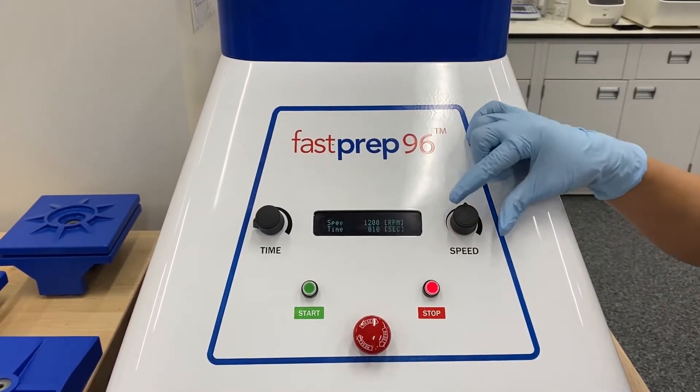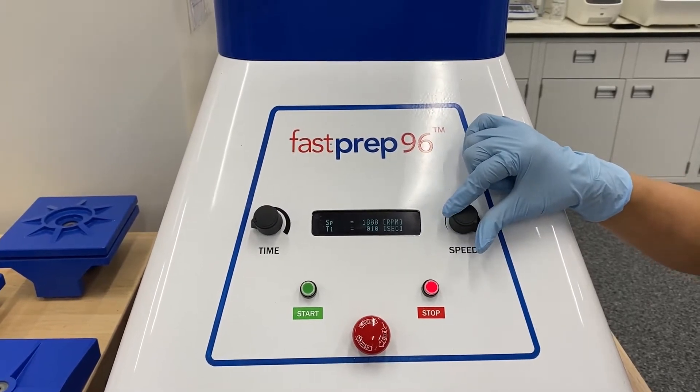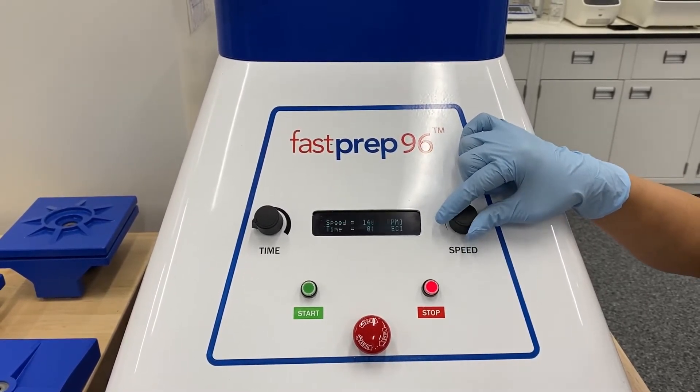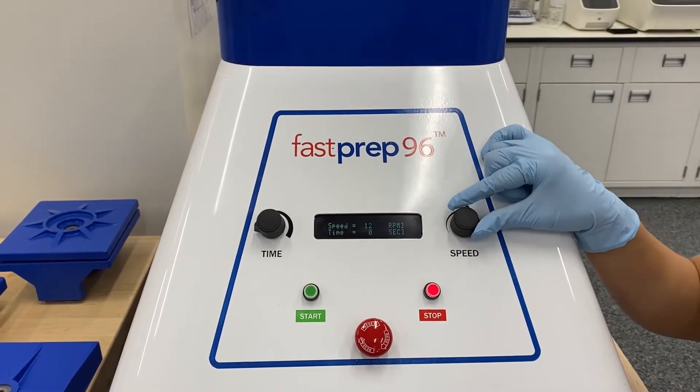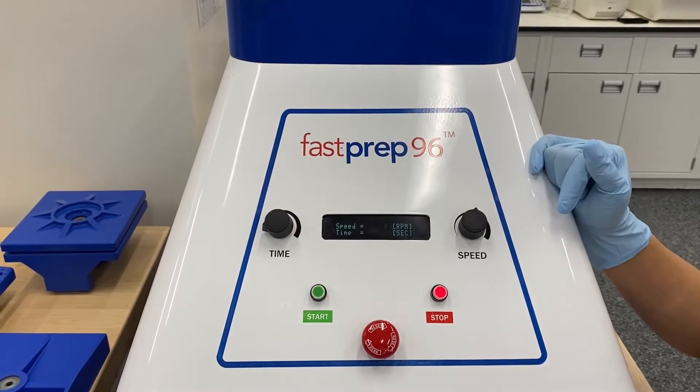This knob to the right is for speed, so you can increase your speed all the way up to 1,800 RPMs. If you have a FastPrep 24, you're probably familiar with meters per second. We do have a conversion table that we can show out to.